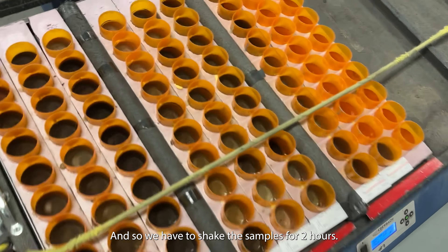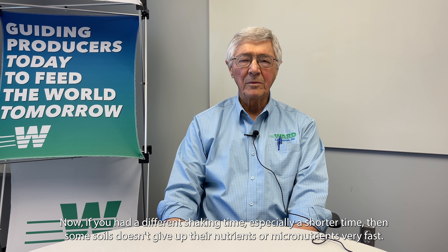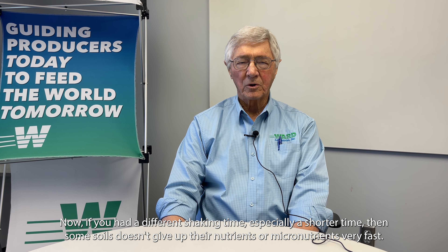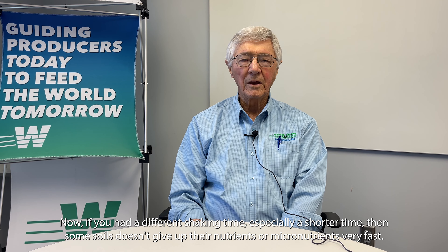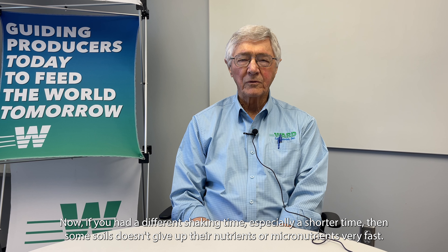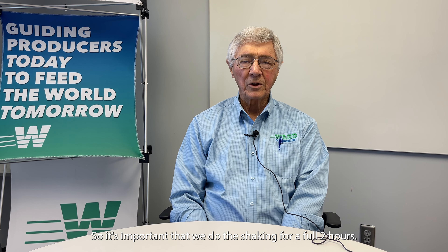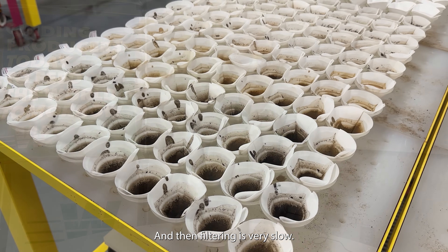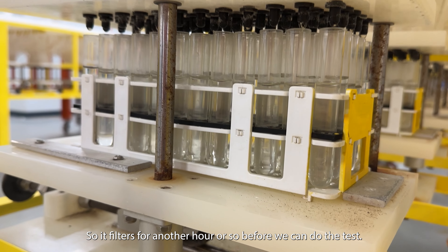We have to shake the samples for two hours. If you had a different shaking time, especially a shorter time, some soils don't give up their micronutrients very fast — so you'd have a lower test result and a higher recommendation. It's important that we do the shaking for a full two hours. Then filtering is very slow, so it filters for another hour or so before we can do the test.